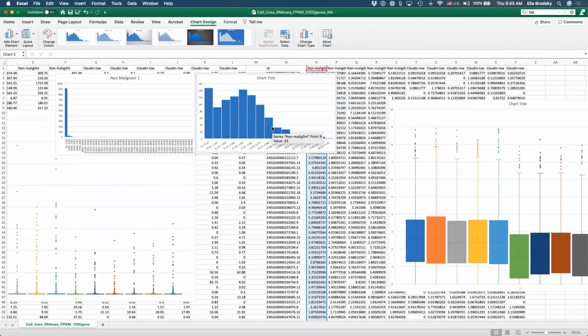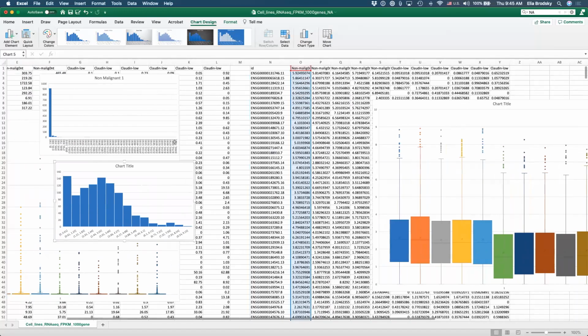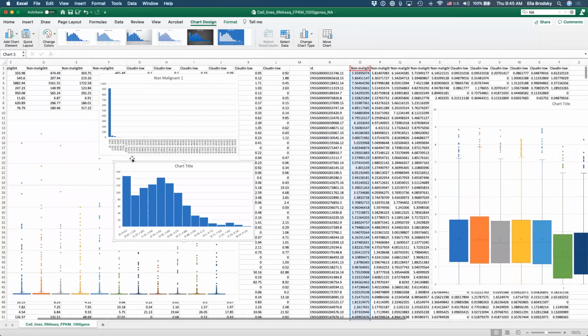Okay, how do we compare them? So here we compared the interquartile range, the maximum, the minimum. We can look at the mean and the median. So these two, the dot and the line, represent the mean and the median. So we can compare some general statistics visually. But how do we know that overall samples from the same condition compare to each other?